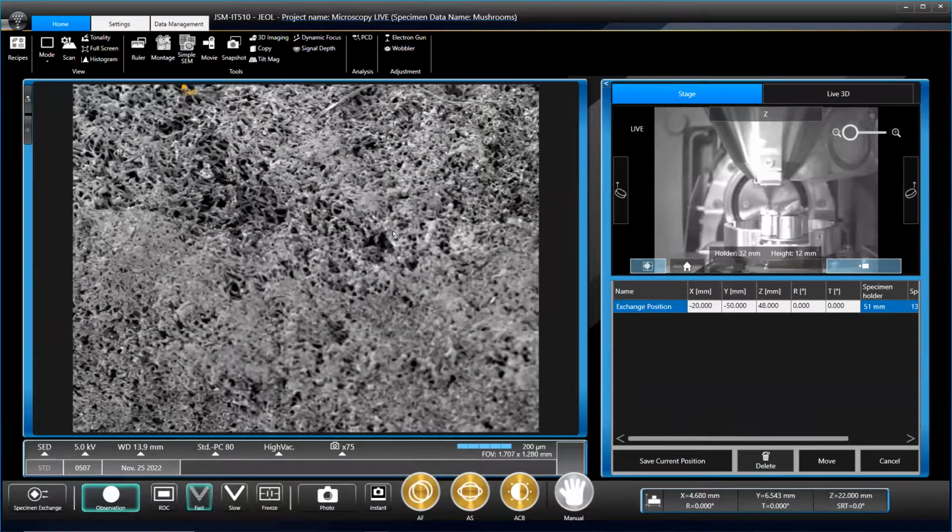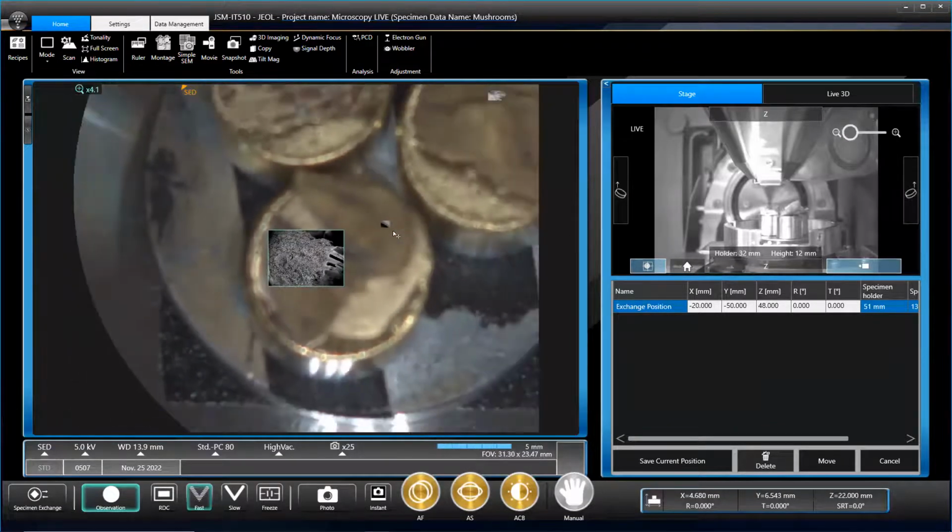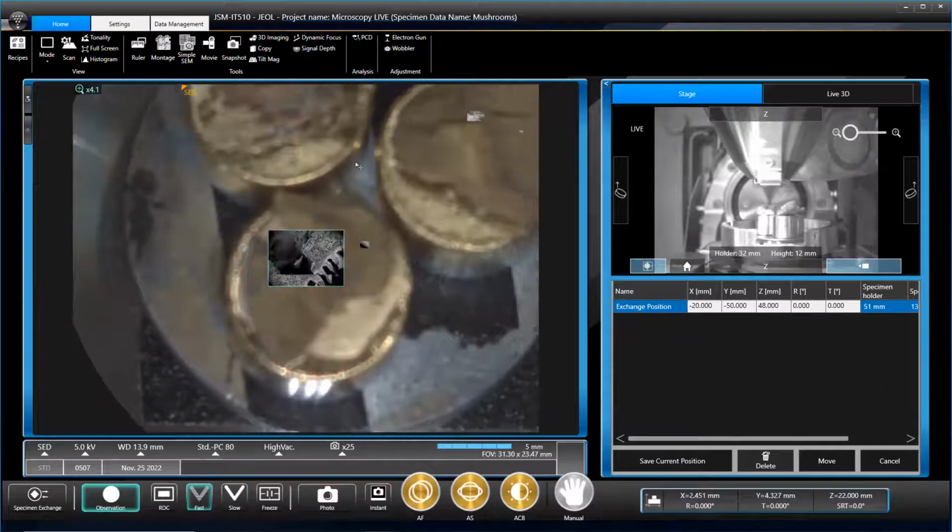Zoom out with another one. Yeah, sounds entirely good. Up to you. I want to see if I can find some inner gills again. Yeah, get that, some cool ones. Take your pick.